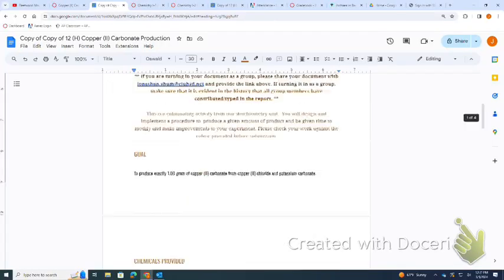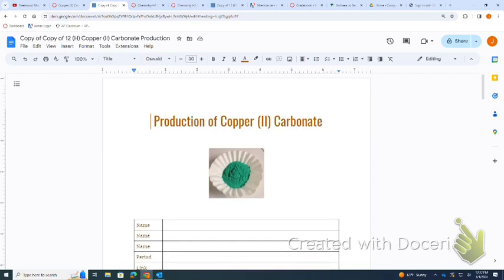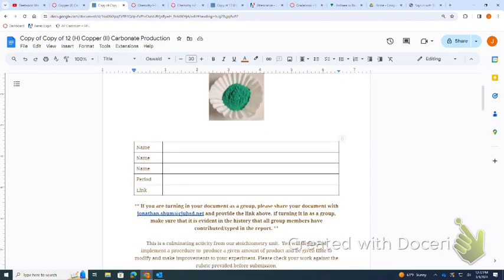So by now, hopefully you have or will take the mass, determine the percent error and the purity with the TAs. And so what we're going to do now is edit, for tomorrow's wet lab, the procedure and the materials, as well as insert pictures, data, that kind of stuff.